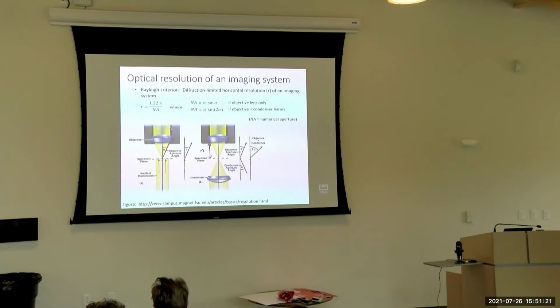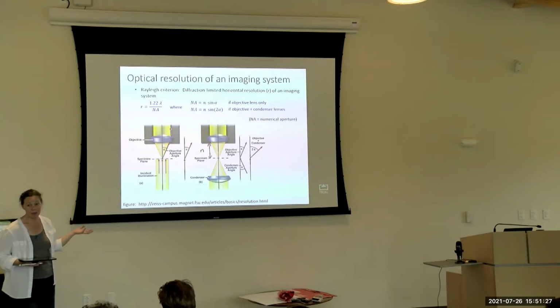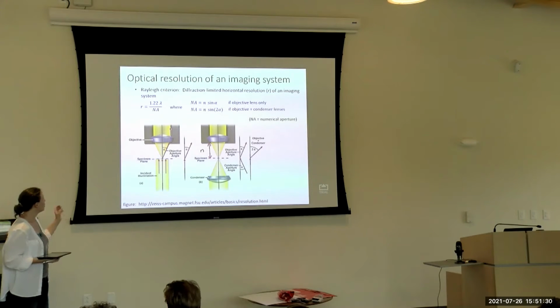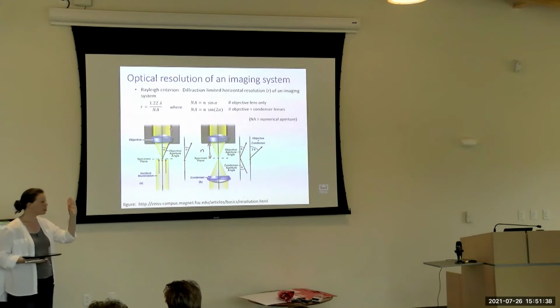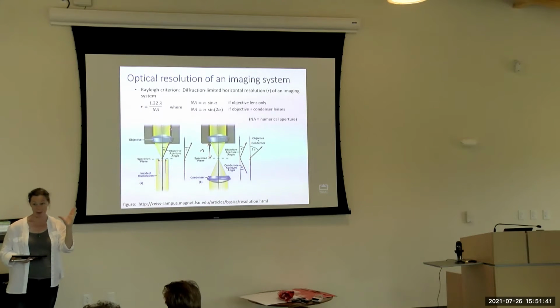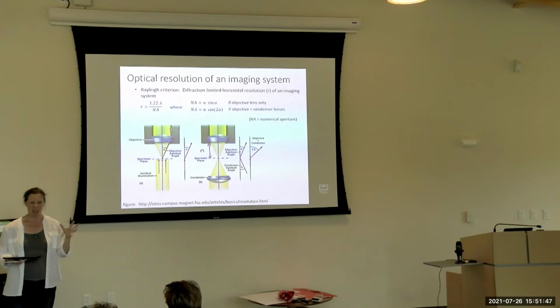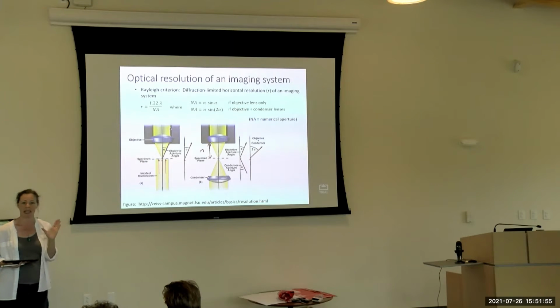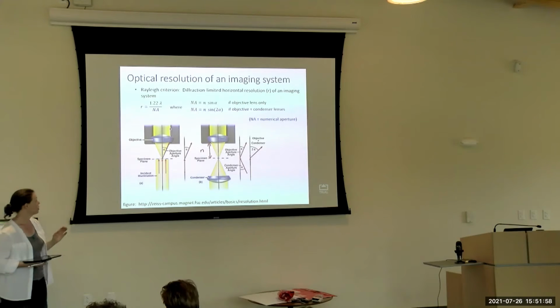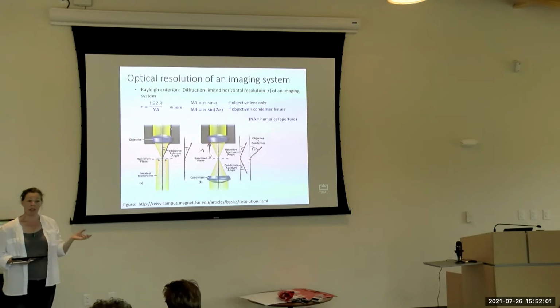So that's another good point. If you have a system where you're looking like a regular microscope in air, and you want a higher optical resolution, a higher horizontal resolution, you can increase your lens angle, your aperture angle, to a point, but there's a practical limit there. Lens manufacturers say the upper limit for that half angle alpha is around 70 or so degrees. It's difficult to make a lens that captures more widely than that, and that's a good lens. So the other thing you can do is increase n.